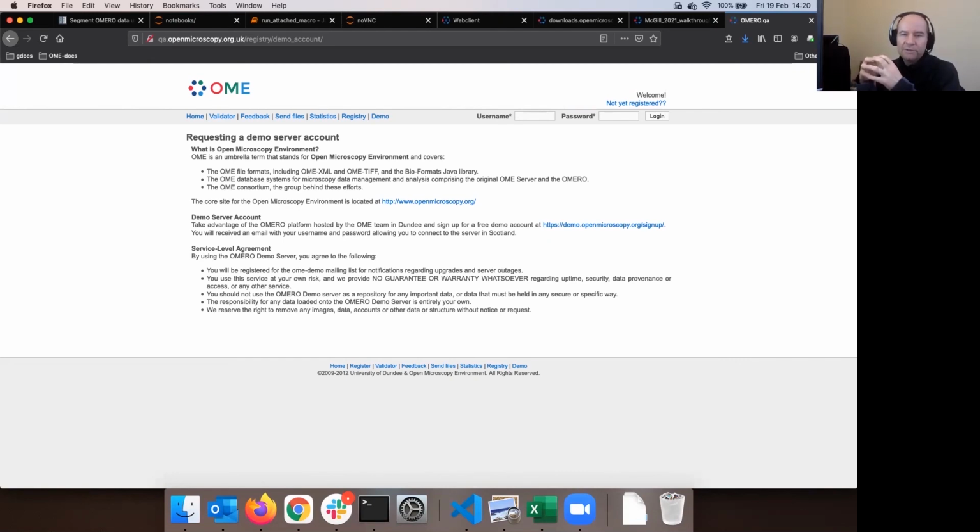Instead, the Ome team simply says there is only that much space, and if the world exceeds that space by importing too much data into that server, the Ome team will more or less indiscriminately delete the data on that server as they see fit, to prioritize new users from the world who want to create a new account, import data and familiarize themselves with Omero.